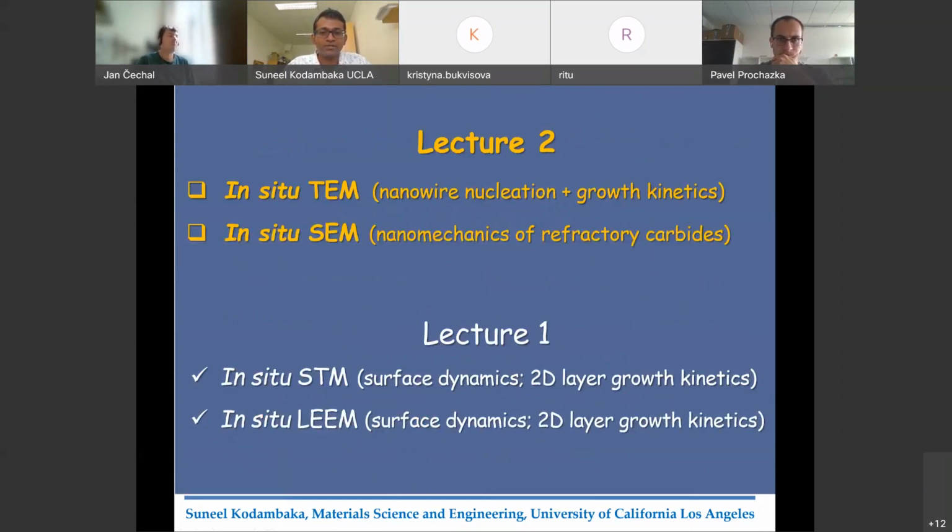In this talk, first I will go over a rather elementary introduction to nanowires. Then I will present some of the results from our in situ transmission electron microscopy studies aimed at understanding the kinetics of nucleation and growth of primarily silicon and germanium nanowires. In the second half of the talk, I will present some of our more recent results obtained using a scanning electron microscope as a tool to observe and quantify the mechanical behavior of highly refractory carbides. These are very high temperature, hard materials.